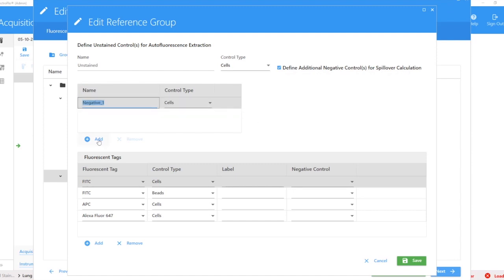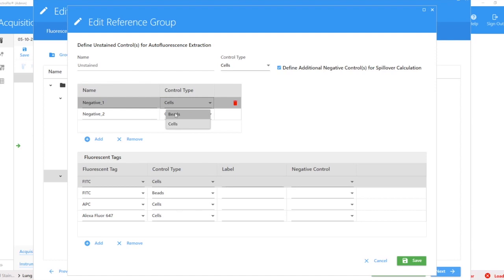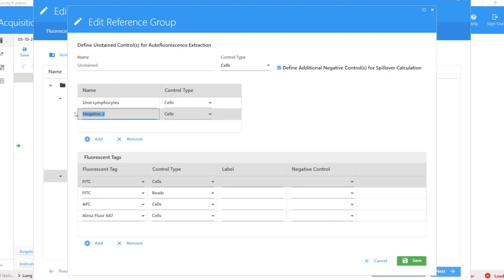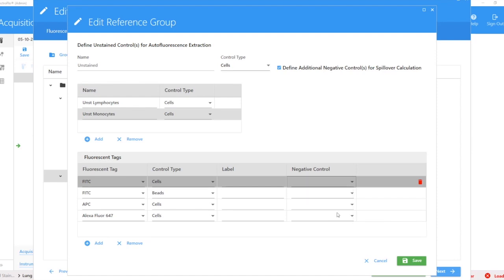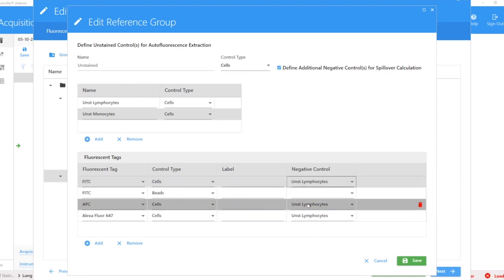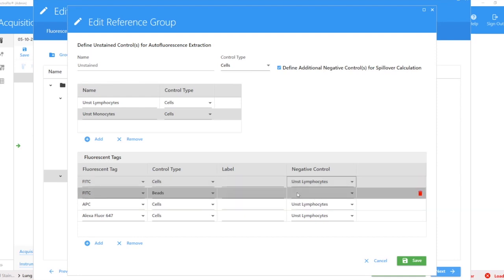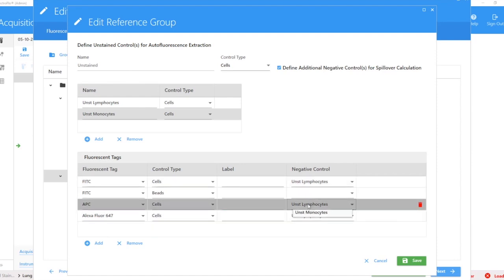At the moment I have a single option because I only have recorded one unstained tube. If I want more options, I need to check this box: define additional negative controls for spillover calculation. This will allow me to generate additional unstained tubes. You can label them however you want and also have the option for beads and cells. Here I'm going to change this to unstained lymphocytes and unstained monocytes. Now I have more options for my negative control. If you change the control for the first tube, it's going to automatically apply that to the remaining tubes, but you can always change those individually.